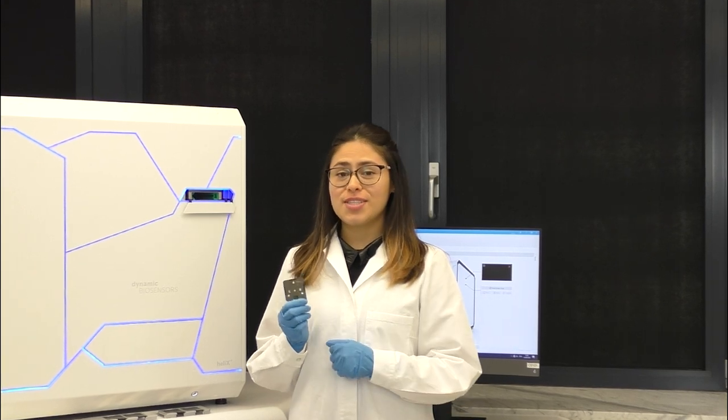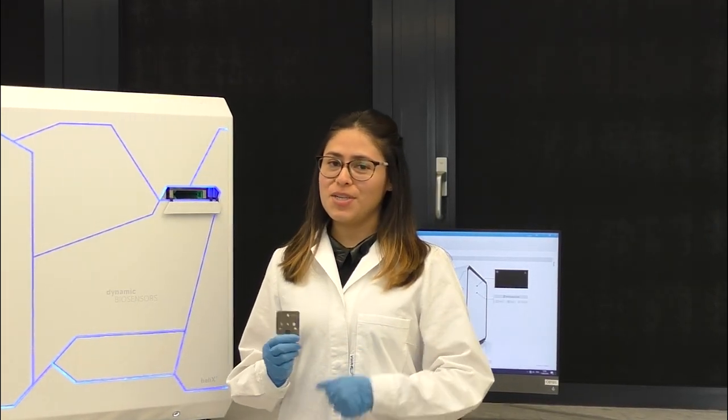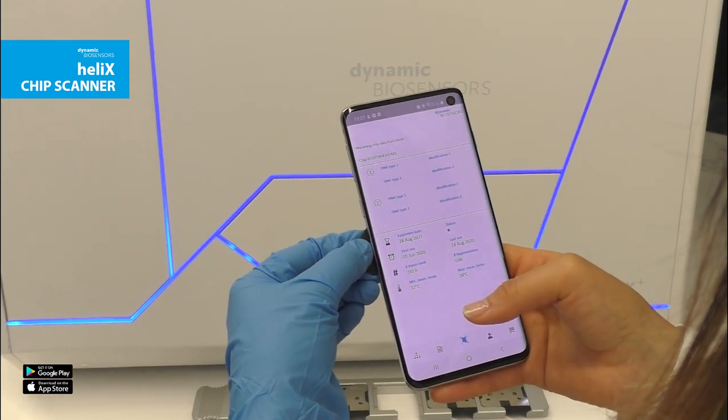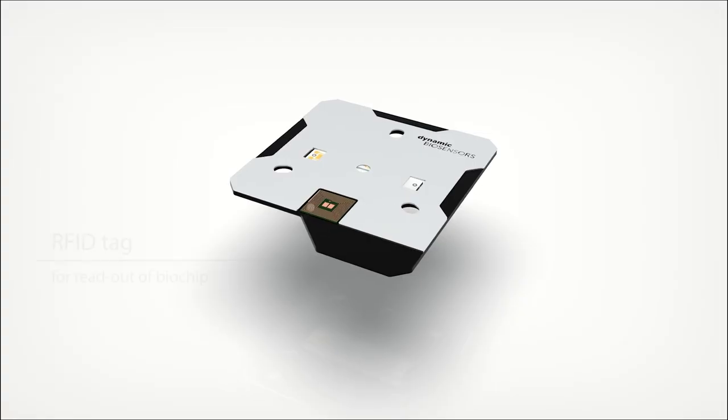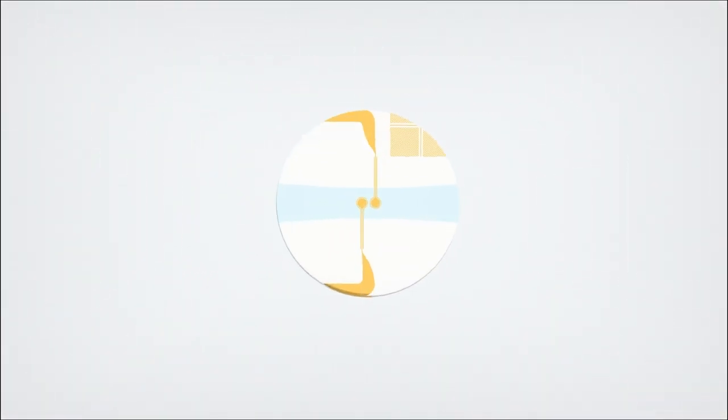This is the Helix chip. Due to its integrated microfluidics, there is no flow cartridge or IFC in the instrument itself, eliminating the need for regular maintenance as in conventional SPR systems. The chip features an RFID tag which allows the instrument to communicate with the chip to record and display information about the chip type and its usage. You can also read the chip info with our Helix chip app that is available for download now for iOS and Android. This can be especially handy when you are, like me, sometimes working with used chips and you would like to know how often you or your colleagues have used the chip, at which temperatures it might have been exposed to, which was the last status of the chip and so on.